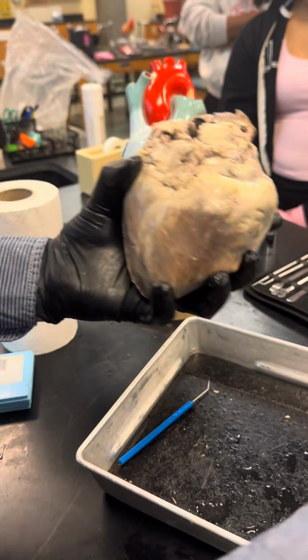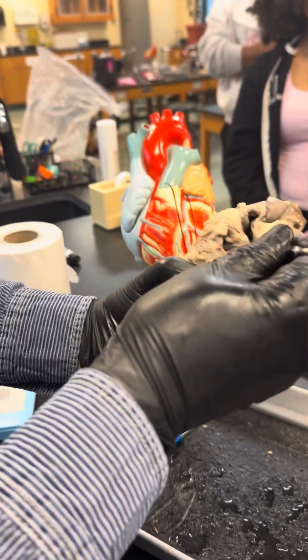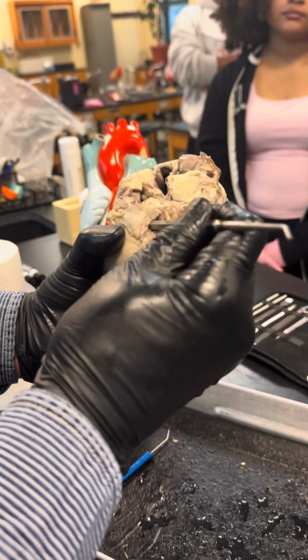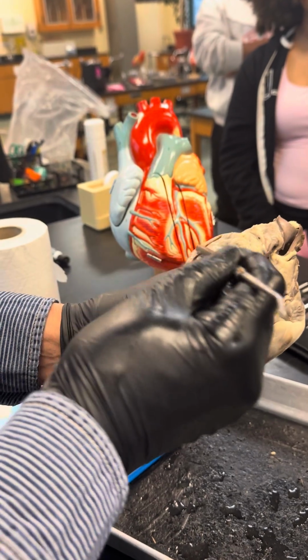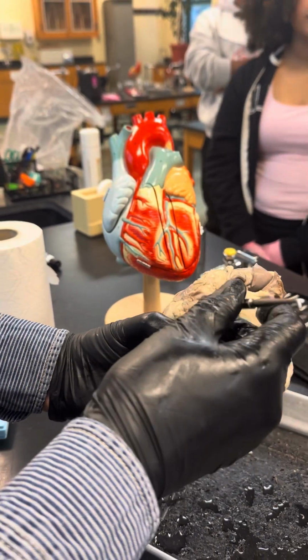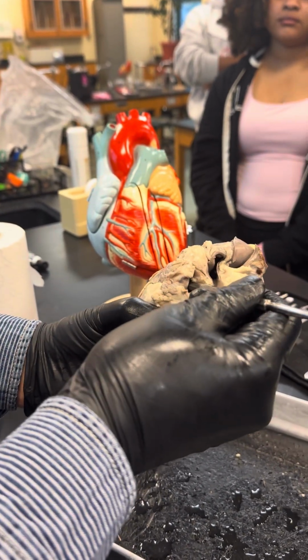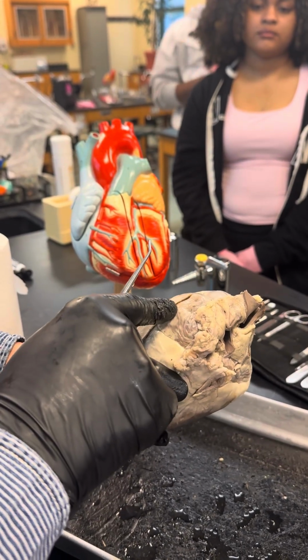When the blood goes to the lungs, from the lungs it comes back through the pulmonary vein. See, this is the pulmonary vein right here. From the right and left lungs, blood comes to the left atrium, right? This is the left atrium. The blood vessel is not there; it's already cut. So this is called the pulmonary vein, which drains to the left atrium.